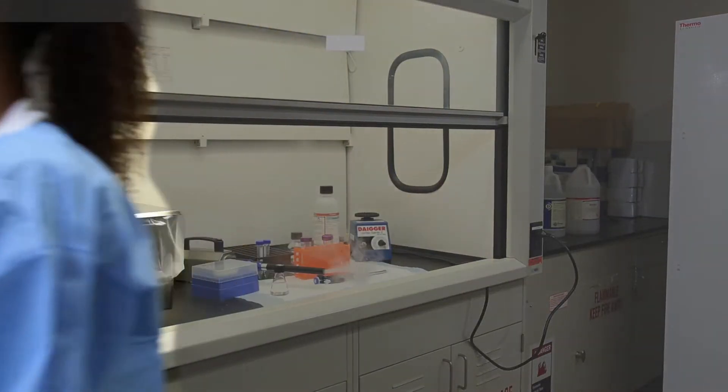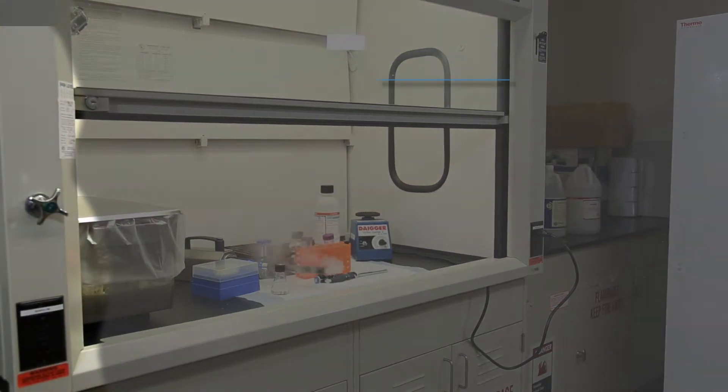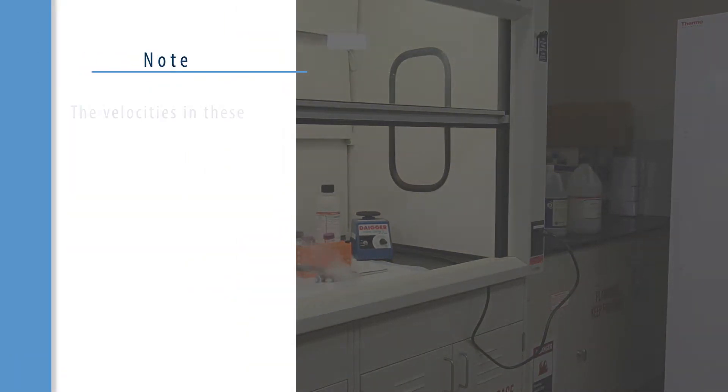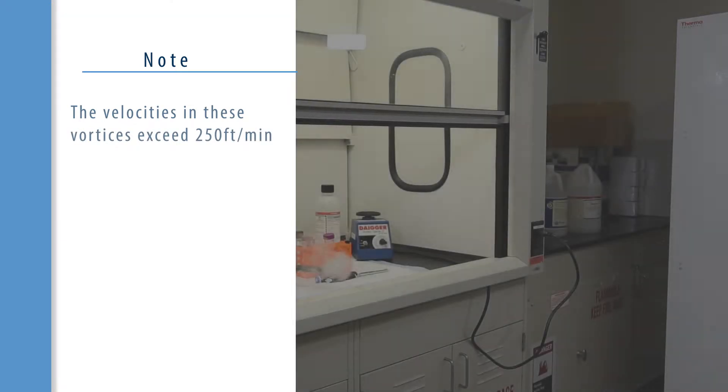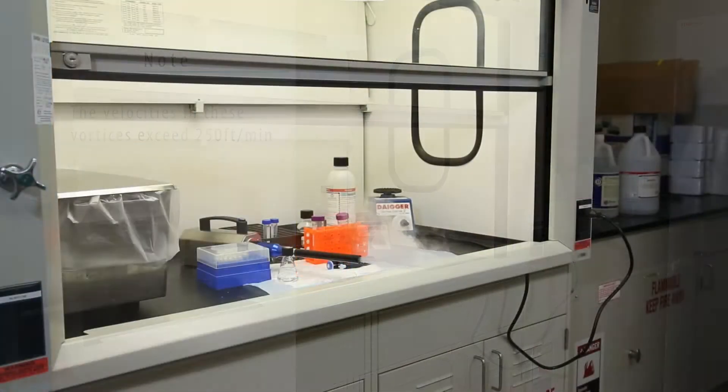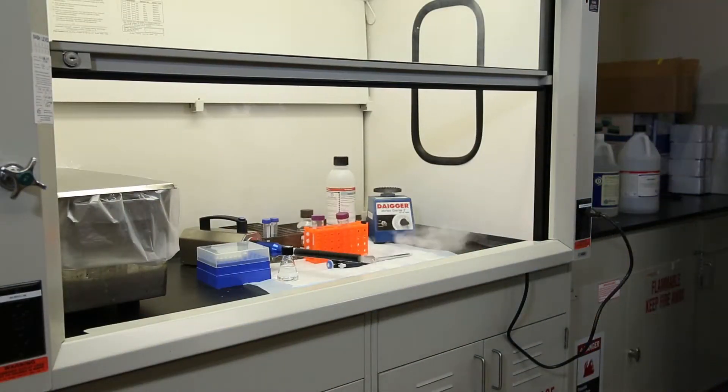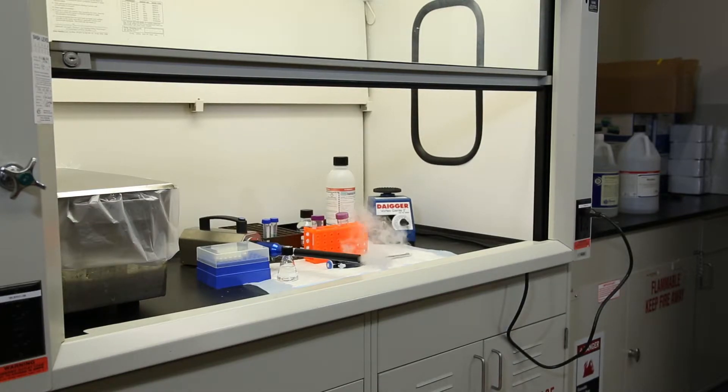Wakes or vortices form behind a person who is walking and the velocities in these vortices exceed 250 feet per minute. When a person walks in front of an open fume hood, the vortices can overcome the fume hood face velocity and pull contaminants out of the fume hood.